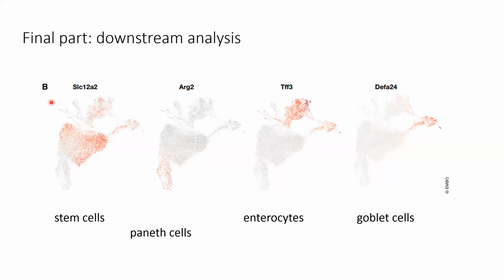So after we have our cell clusters and we've mapped them with some notion of cell type, either using previous orthogonal measurements like FACS or looking for marker genes that we know to be relevant to our system and annotating our cell types, a natural question to ask next is which features distinguish these different types of cells, or which features distinguish two experimental conditions.